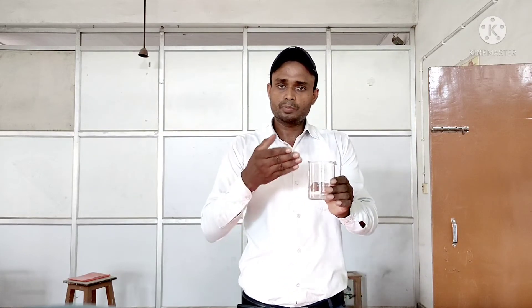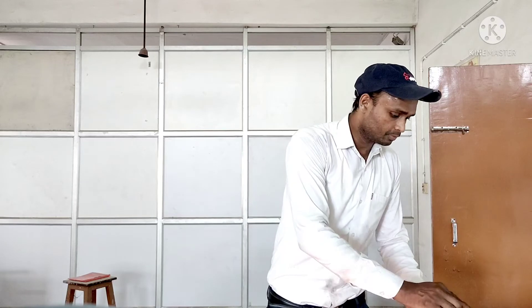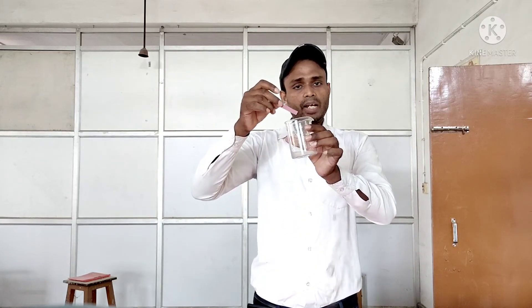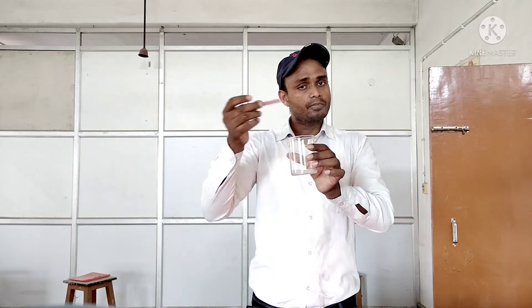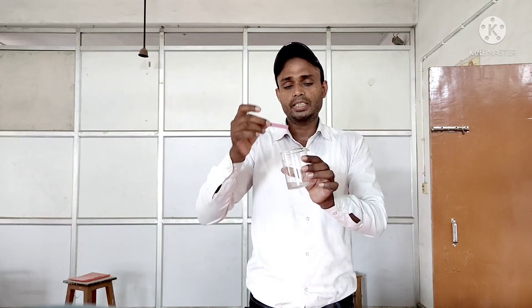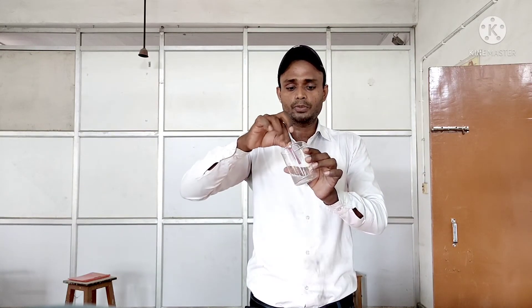Now we have red litmus paper. Dip the red litmus paper — it changes to blue. This confirms that this solution is basic in nature. Red litmus paper is used to identify a basic solution. The magnesium oxide dissolved in water gives magnesium hydroxide, which is basic in nature.